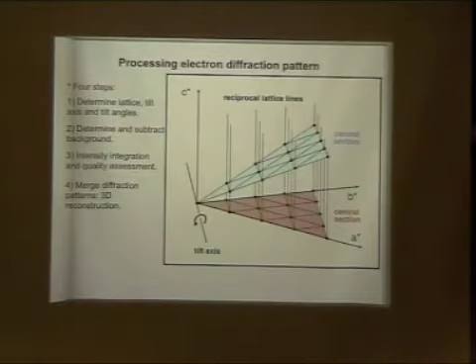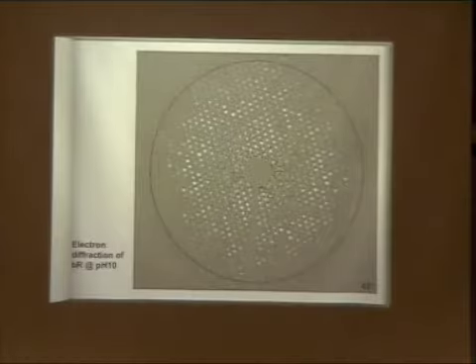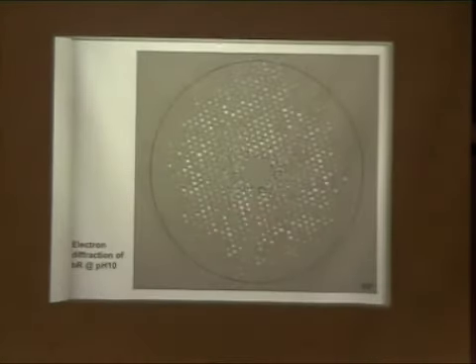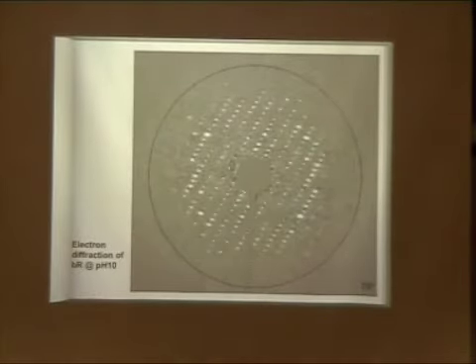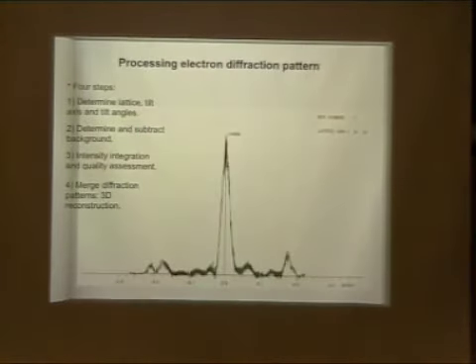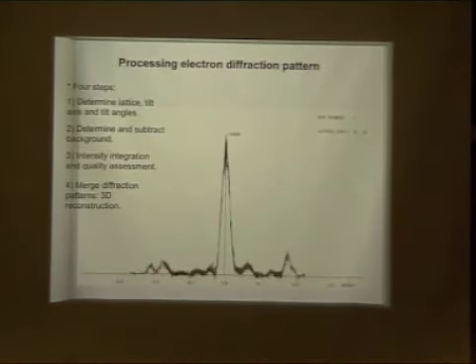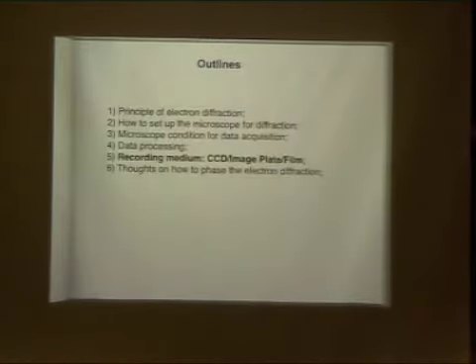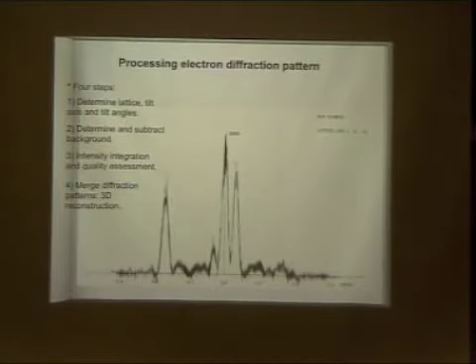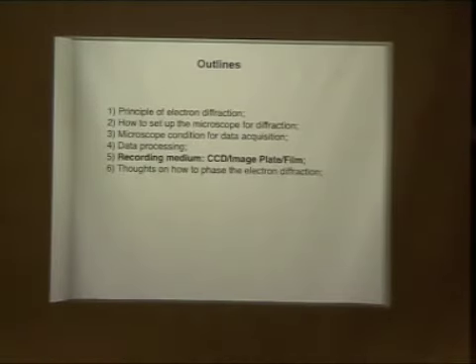And then basically, people often call this a 3D reconstruction in reciprocal space. For example, we have shown you a 0 degree, a 45-degree tilt diffraction pattern, a 60 degree, and a 70 degree. All these together give you a merged lattice line, made of different lattice lines. You can see that they all extend to a reasonably good high resolution. And then from there, you can calculate your structure.